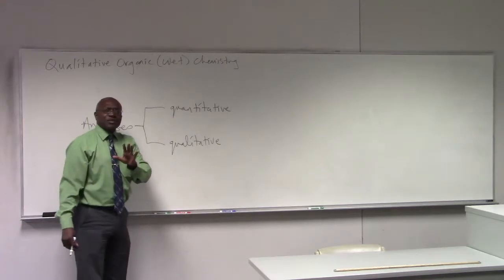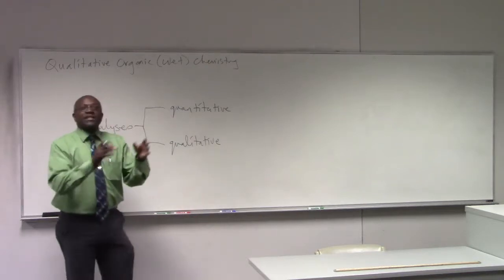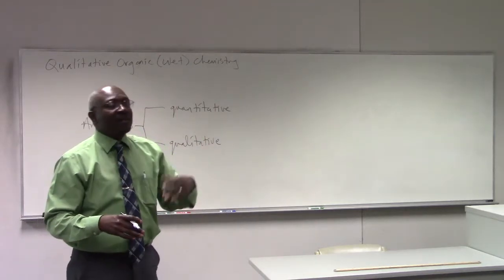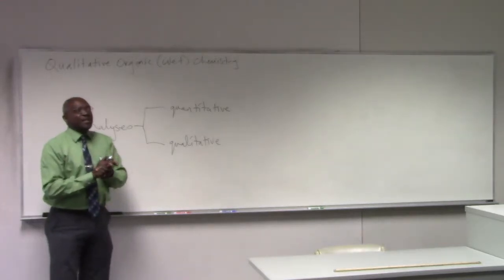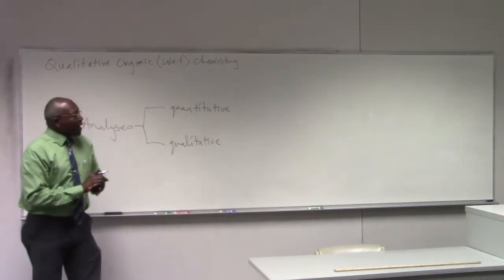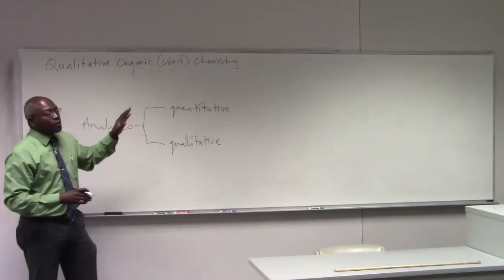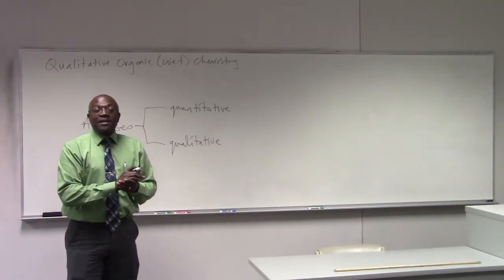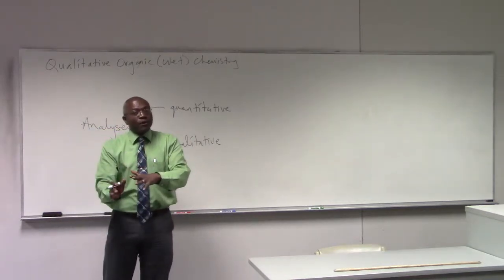And we do some of that in organic chemistry, but we're much more concerned with qualitation, which is what is present. We could be asking, what do we have, benzene, acetone, and so on. But for this part of the course, what we're really more interested in is the presence or absence of functional groups, or of certain substructures. So over this part of the course, we'll be looking to see whether a compound contains a carbonyl, whether it contains a haloalkane, and if it does, is the haloalkane a chloro, bromo, or iodo? Does it have a methyl carbonyl or a methyl carbinol, and that sort of stuff.